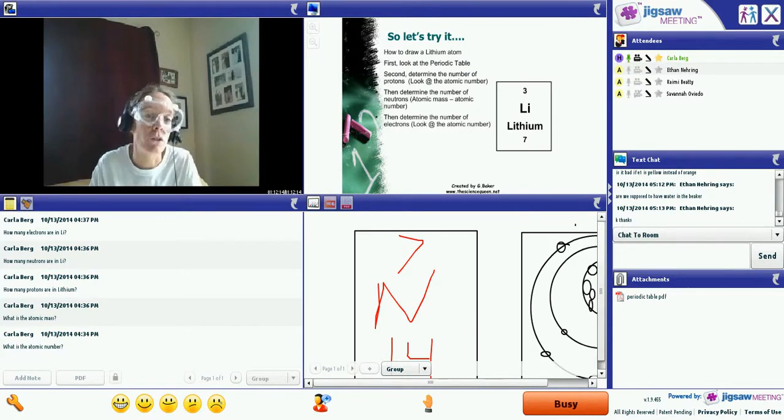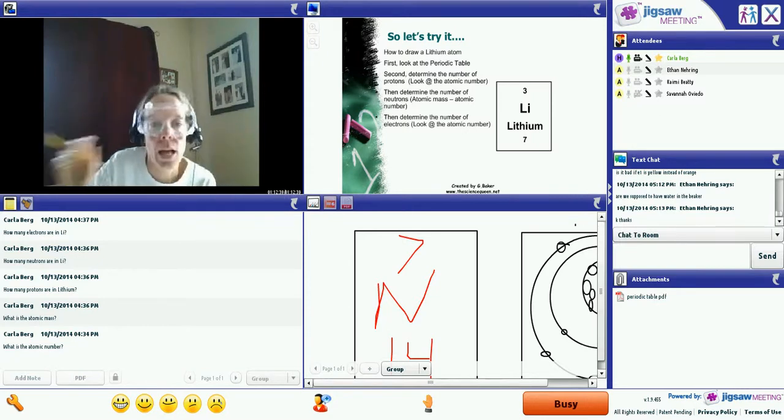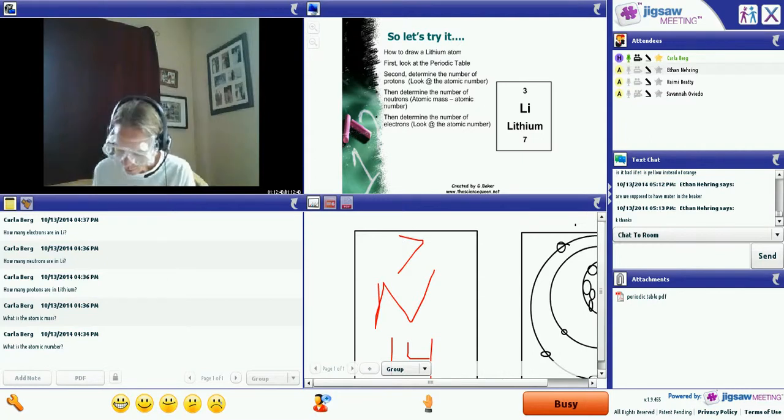So what I'm going to do, and if you don't have any, you are going to do the same, I am going to judge my well that had the most precipitate as the well that has the darkest brownish color. So you are going to figure out, does well A1, B1, C1, D1, or E1 have the darkest brown color?